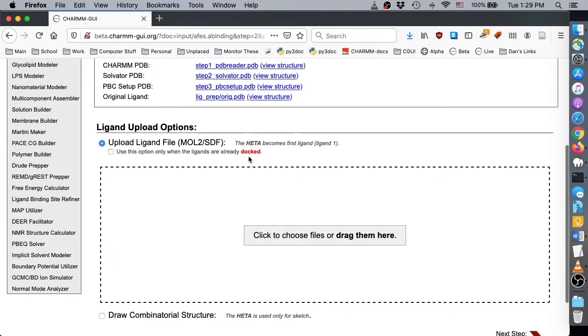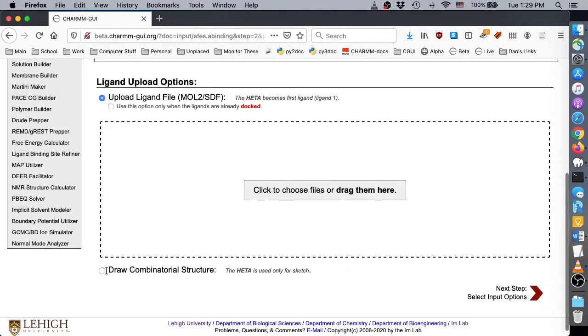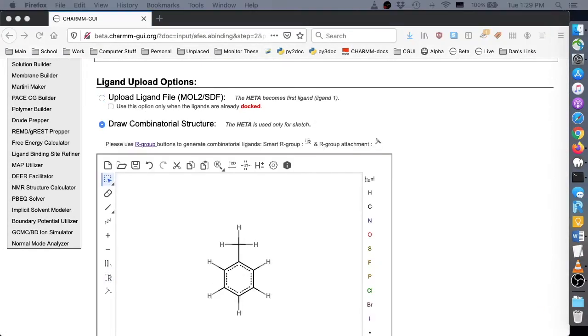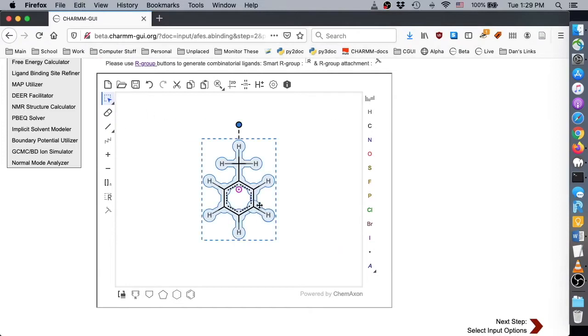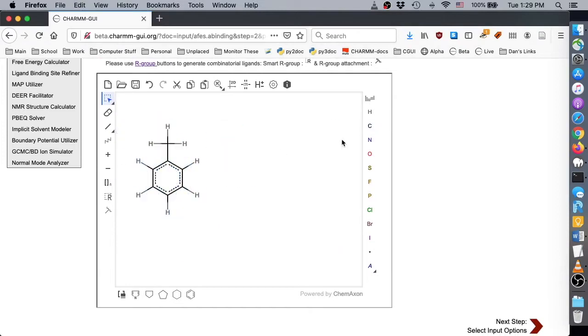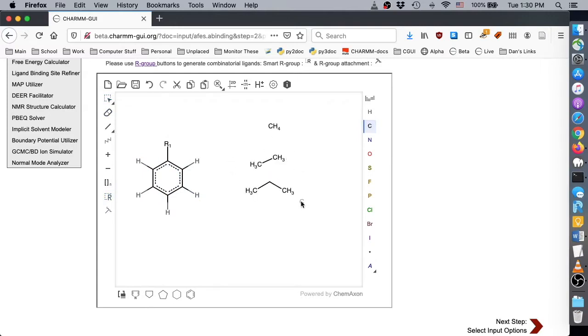For this demo, we'll click the Draw option to draw the combinatorial structures of the toluene derivatives with different alkyl chain length. If the drawing steps are unfamiliar, please see the video demos for Ligand Reader and Modeler.